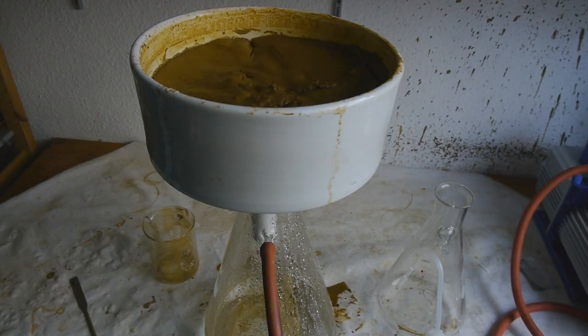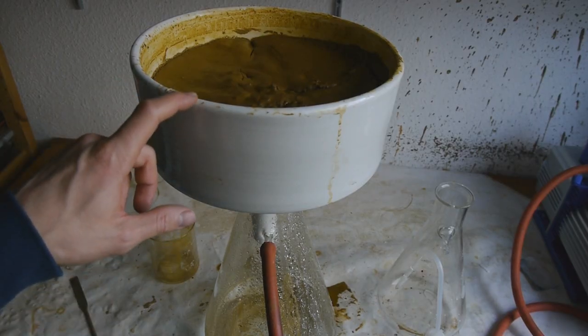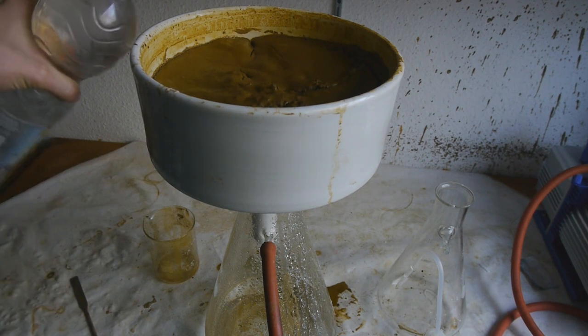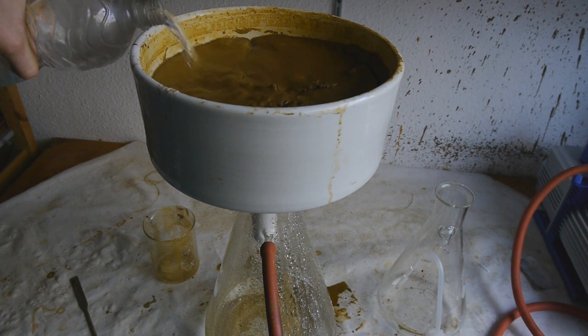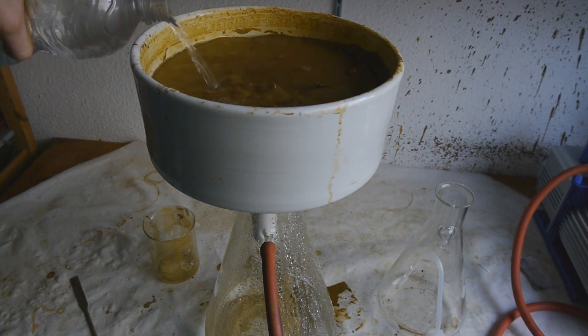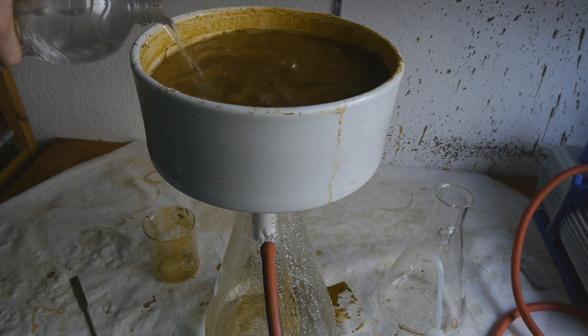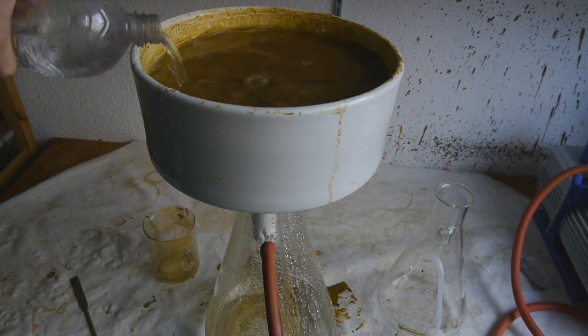So filtering the water the second time went a lot faster. Maybe the sodium sulfate was clogging up the filter, and now let's just repeat this washing procedure for 2 more times and then it should be relatively pure iron oxide hydrate. And then we of course still have to dry it.